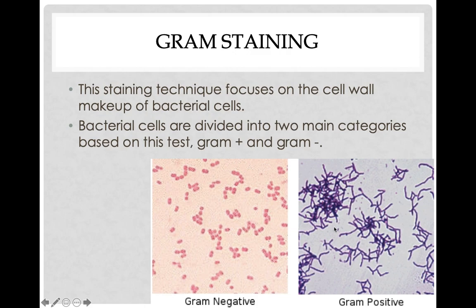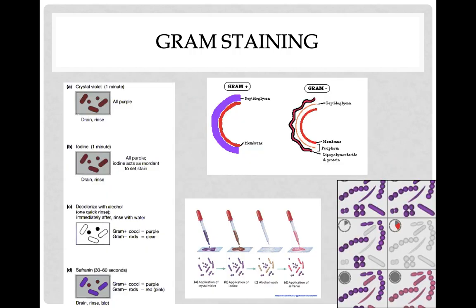This type of test takes about 3 minutes if you do it correctly and if you're good at it. So you can figure out your results very quickly, which type of antibiotic to start with. Like I said, the antibiotics don't work on the other classes, so it's a very, very important thing to do. This is the very first step for diagnosing any type of bacterial infection. You have to know what its gram reaction is.